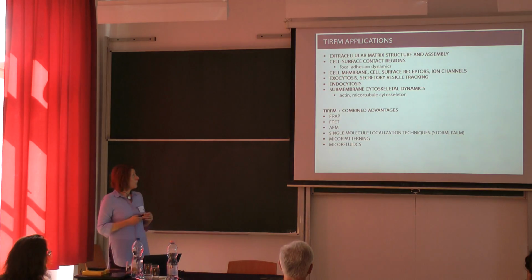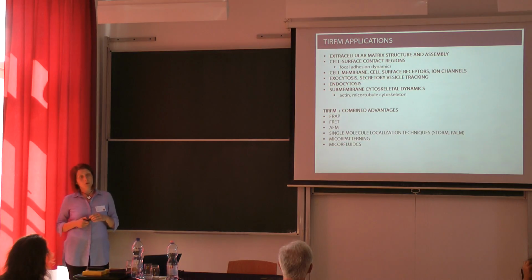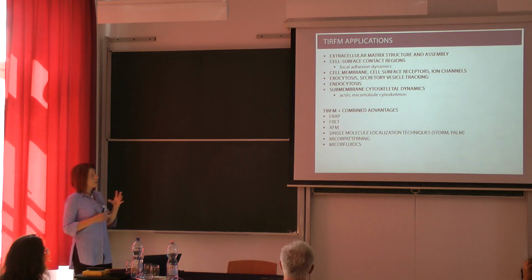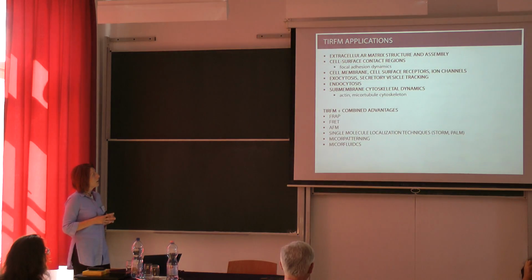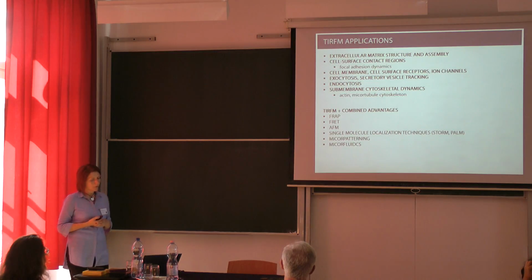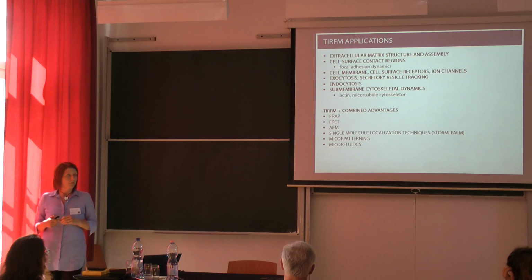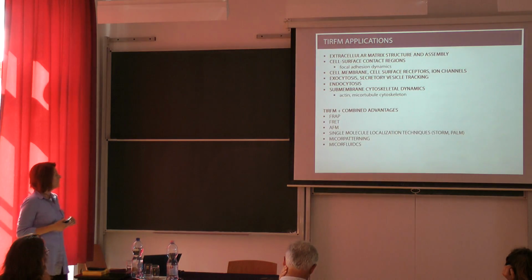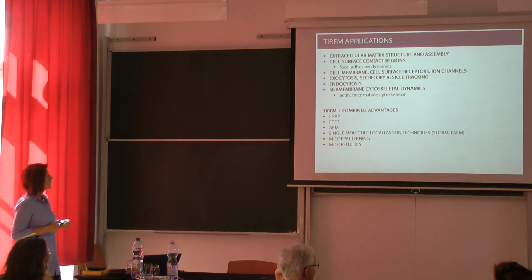Also, one good thing with TIRF is that it can be combined with other approaches, and then the advantages of the two approaches are also combined. If you combine, for example, TIRF microscopy with fluorescence recovery after photobleaching, you get information about the diffusive behavior of the surface-close structures.